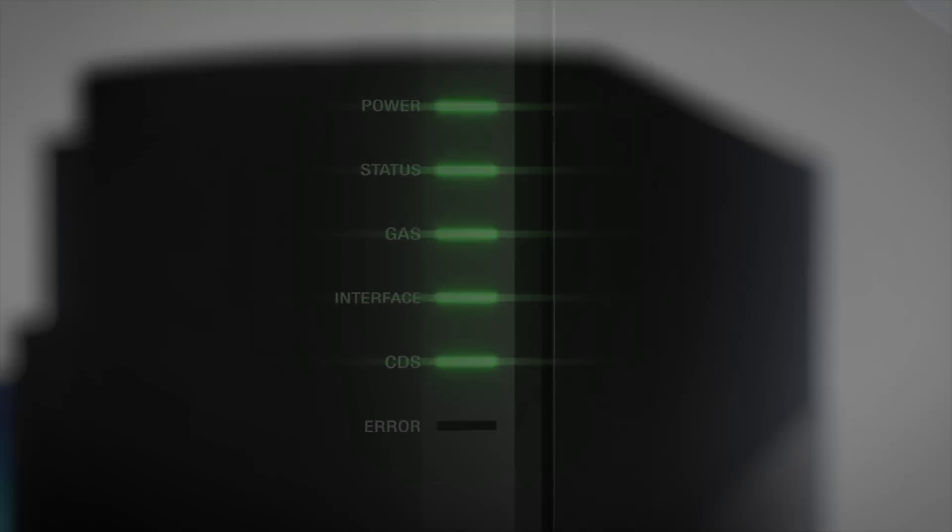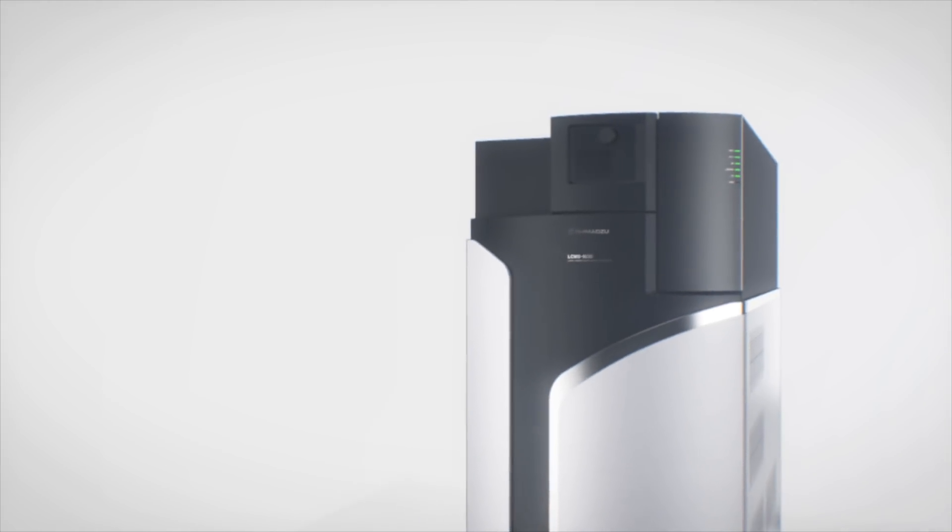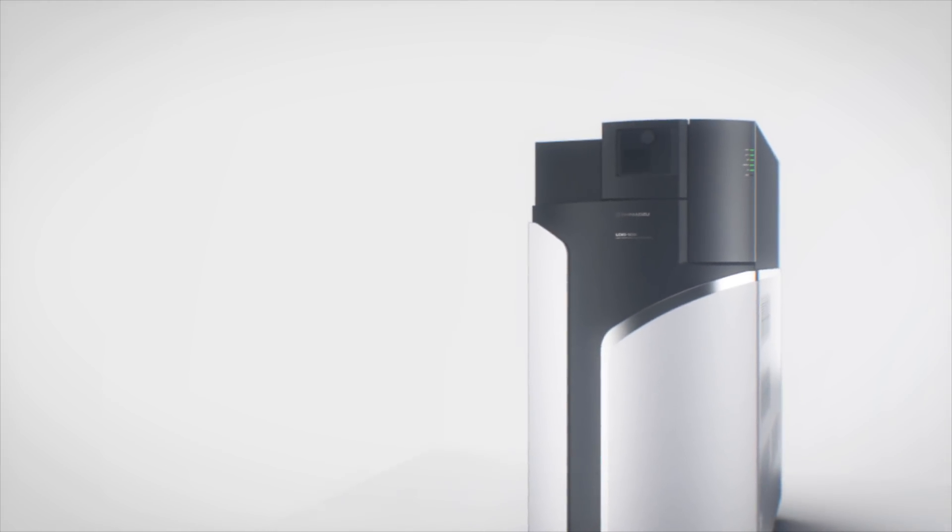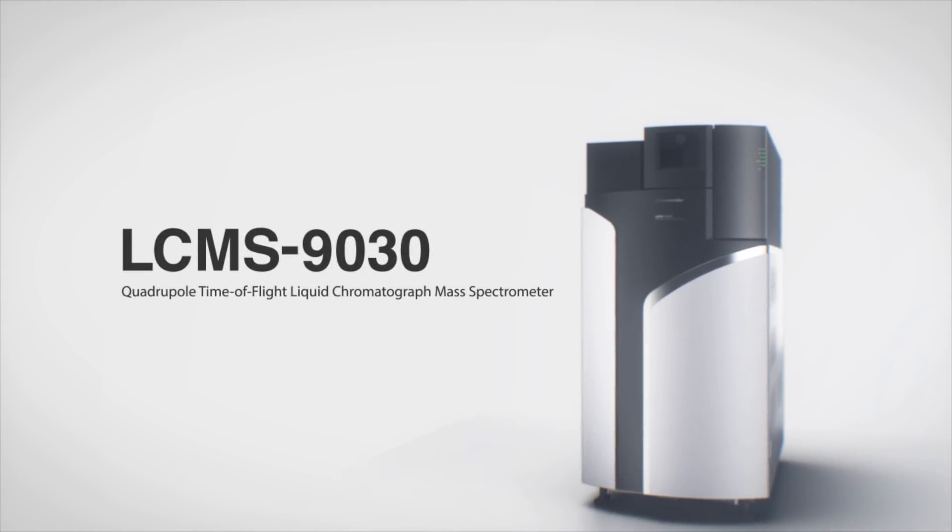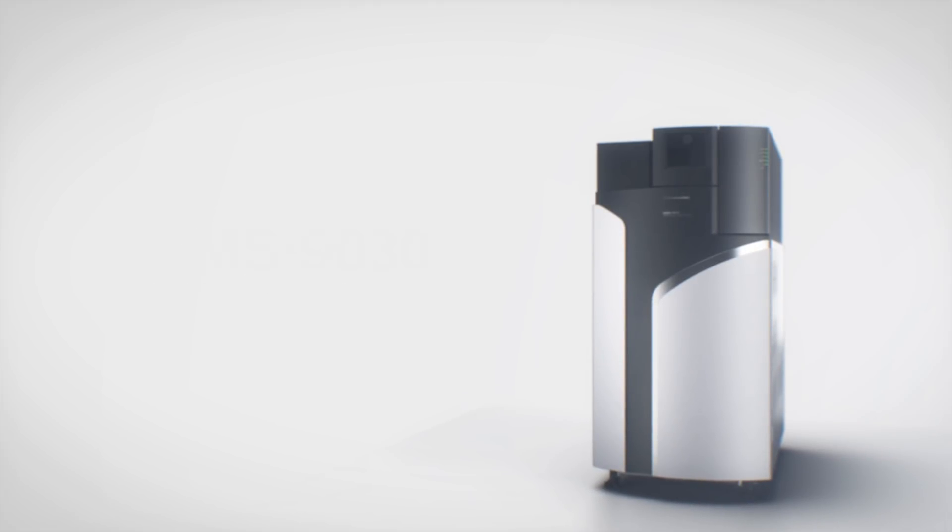Integrating both new and proven technologies, the LC-MS 9030 is the instrument for effortless performance.